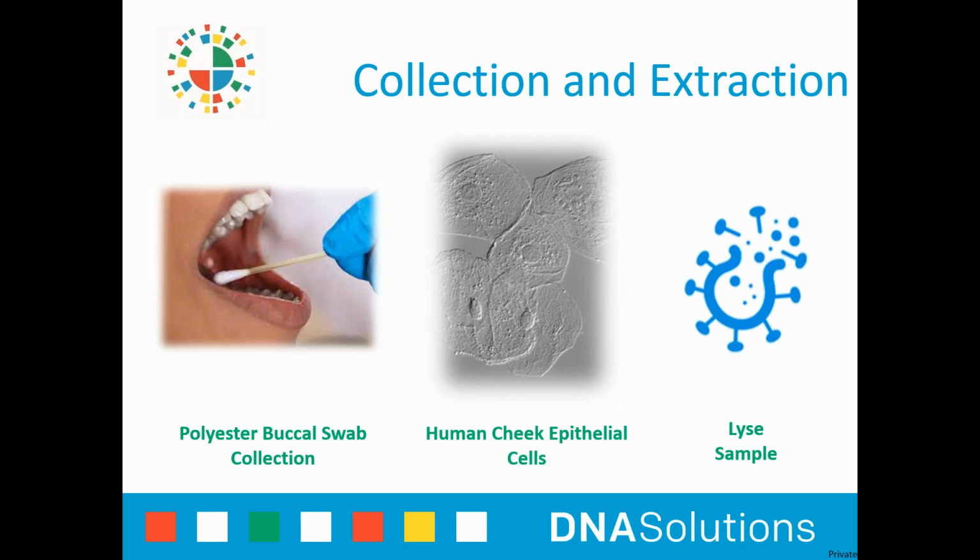And we have to take extra steps to get the cells and the DNA back off the cotton swab. And the yield is very low. And this either means we have to do more work in the lab, or it means that the profile is sometimes partial. We lose some of those markers because there's so little DNA. So please use polyester swabs. We're happy to provide them.